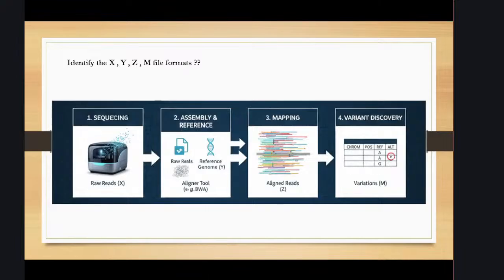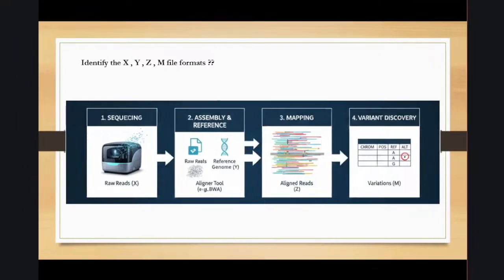Then Y is the reference genome. A reference genome is made a reference genome when it is completely annotated and experimentally proved, so there is no need of a quality score in that. A read is of optimum length, 100 to 150 base pairs or around 300 base pairs, but a reference genome cannot be in a particular 100 to 300 range.